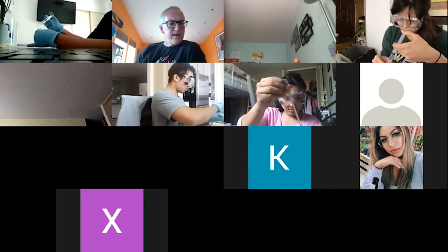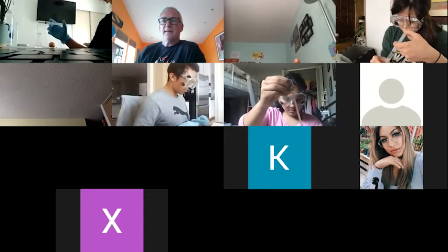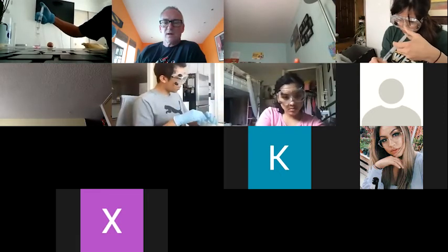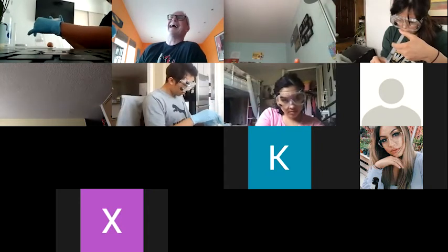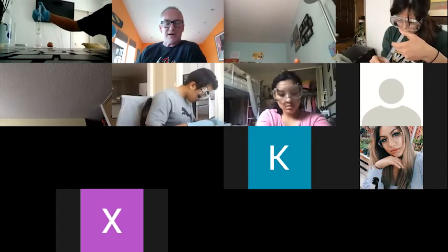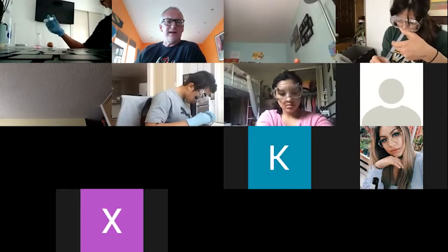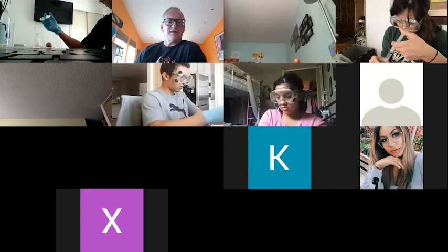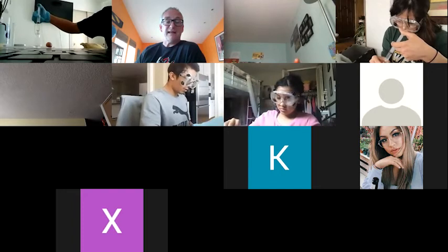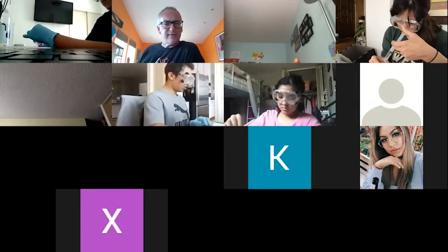So is everybody doing it today, or the rest of you who haven't got your cameras on? Are you not doing the experiment, or just don't have your cameras on? I'm doing the experiment, except I just got back from vacation and my room is a complete mess. Fair enough. I just want to make sure you have your goggles on and everything. I'm not too worried about vinegar. If you get vinegar in your eye, it's not that big a deal. But sodium hydroxide is bad. Sodium hydroxide dissolves organic things like skin and eye lenses.